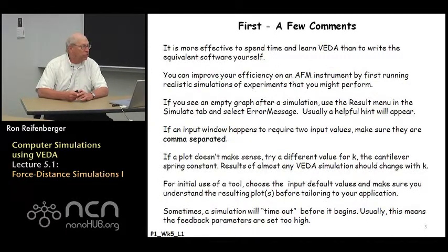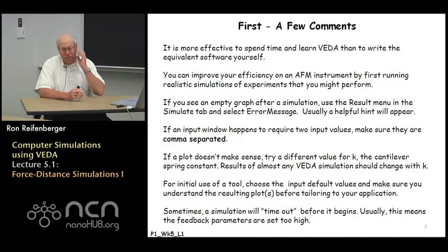First, I'd like to make just a few comments. Just general ideas that have occurred to me over the course of this 5 weeks of lectures. Probably it's more effective use of your time to learn how to use VEDA than to try to write all the software that VEDA already has loaded into it.